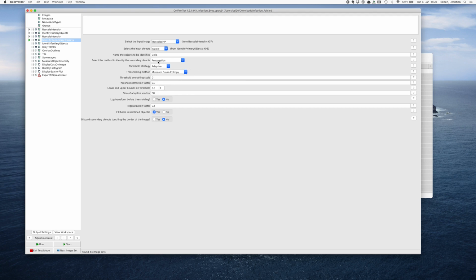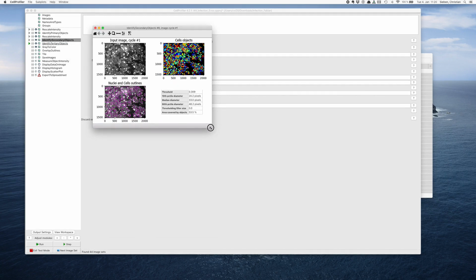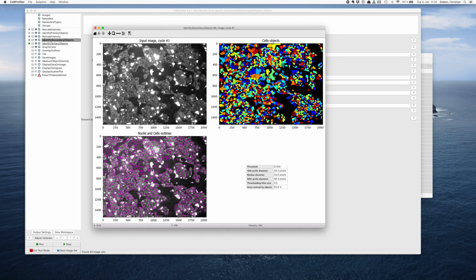So these are very advanced thresholding and segmentation routines that are used here. So let's do that for the nucleoprotein signal. I already optimized these parameters and played around with them, and when I tried it, I could not get it much better than what you can see here. But the cytoplasm, as I said, because we don't have an actual marker for the cytoplasm, is a lot harder than the nucleus.